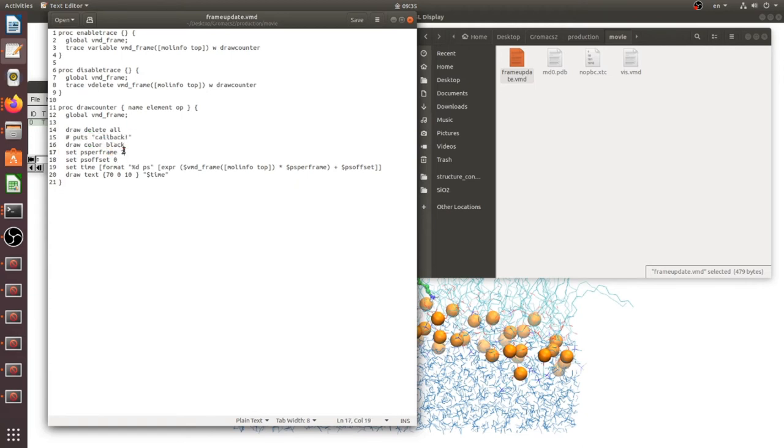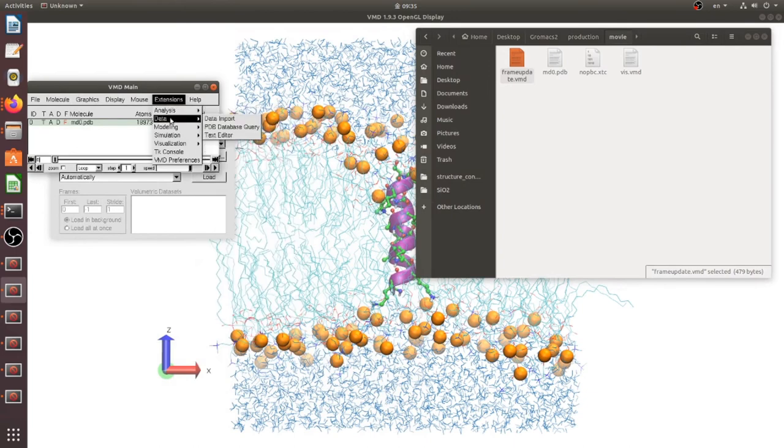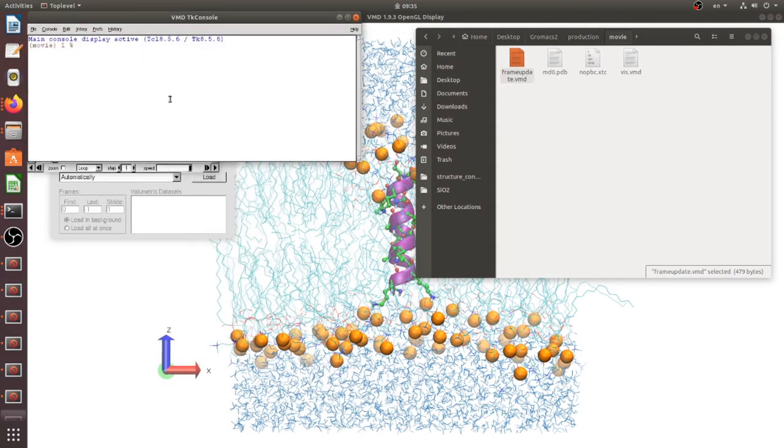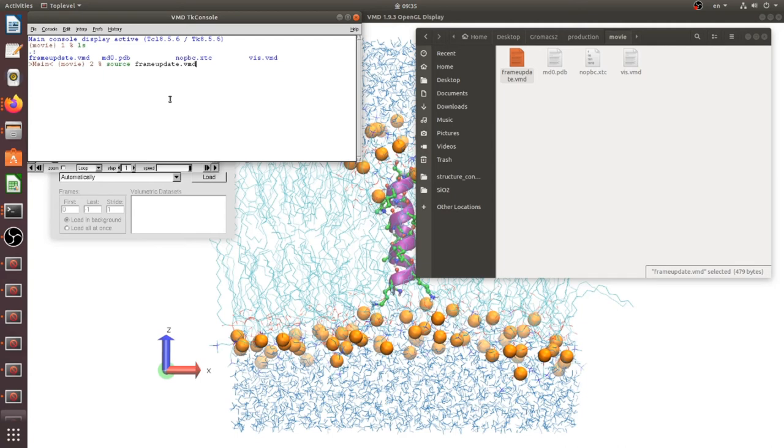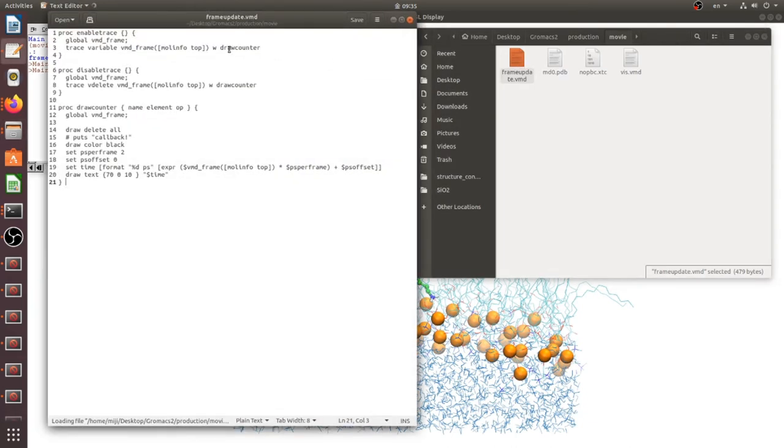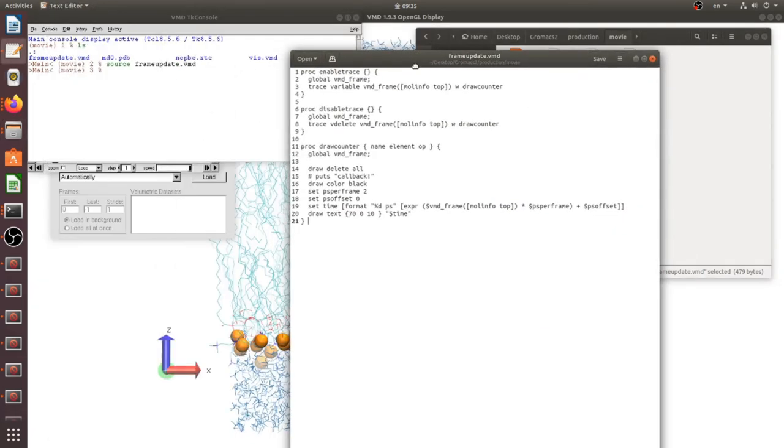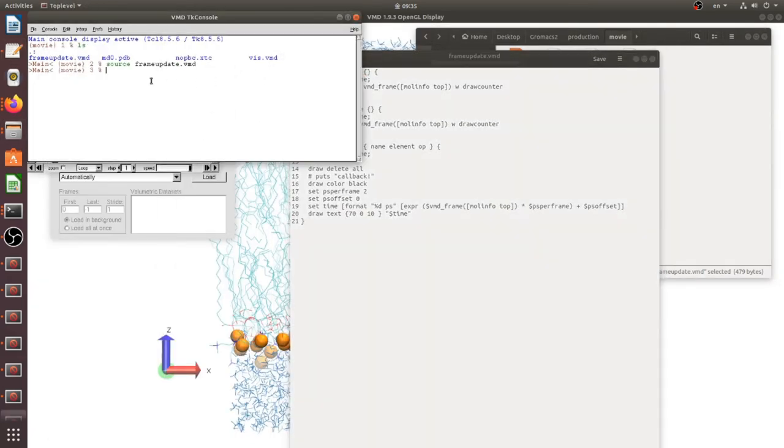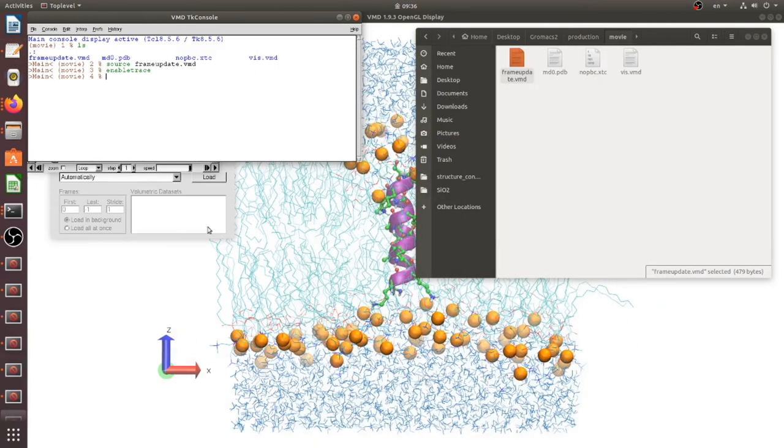Time step is two picosecond and start from zero, and its coordinate of time. Now we should open console, source frame update.